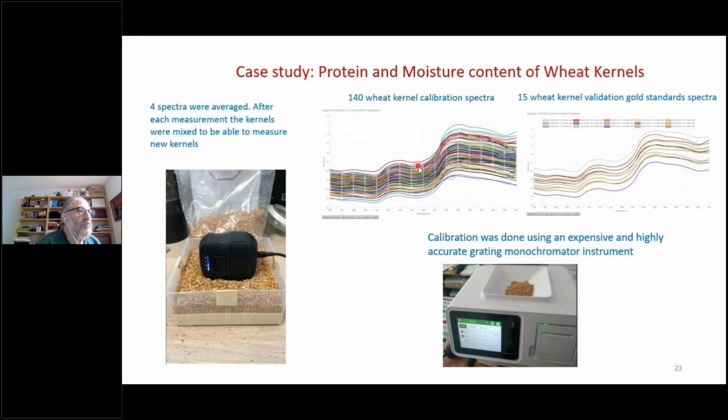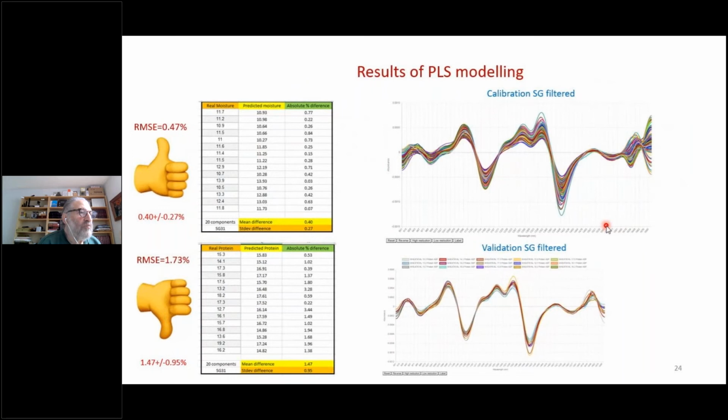So 4/5 would be calibration, 1/5 would be validation. Then we establish the error, and then we would apply it on the test samples. But in the first try, when we did it, we just did the calibration on the 140 and applied 15 validation or test set. So what we found out here is the Savitsky-Golay and second derivative spectra.